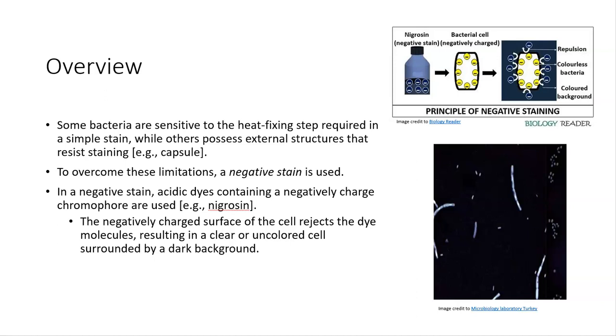A lot of times you're working with bacteria that have maybe a spirillum or a spirochete type shape, which are like loose waves or spirals.